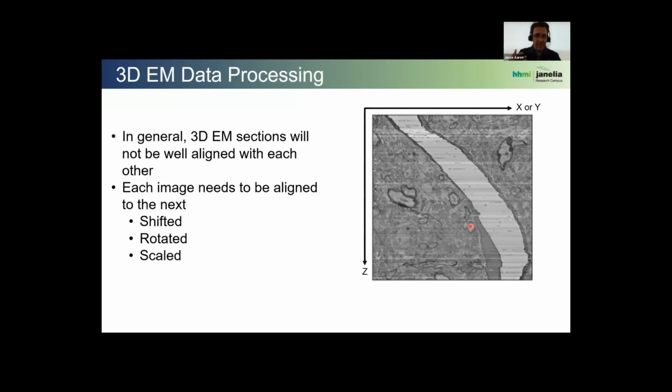And so it is a difficult problem to address. In the past, many people have thought about whether there are ways that we can introduce some kind of fiducial marker into our sample that would act as an unbiased way for us to register the images from one slice to the next. Not always a very practical approach in every instance.